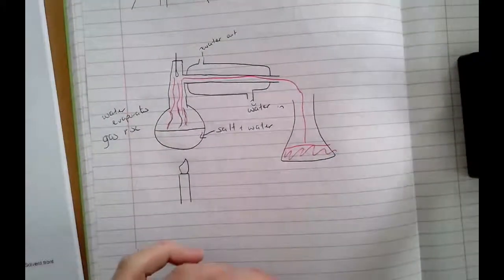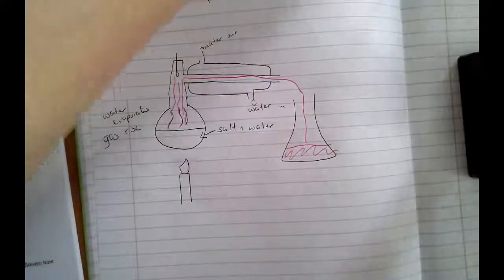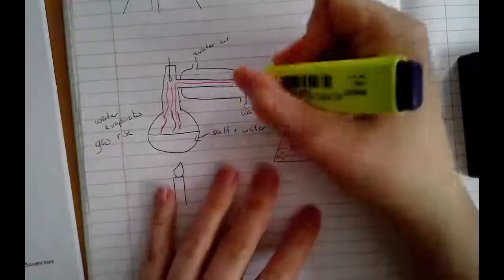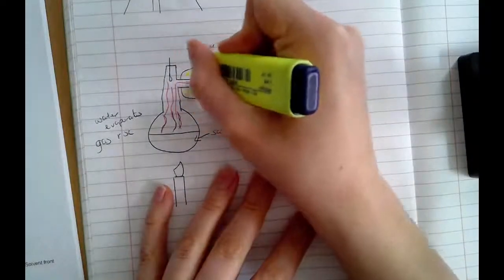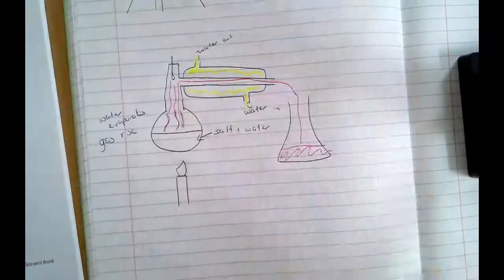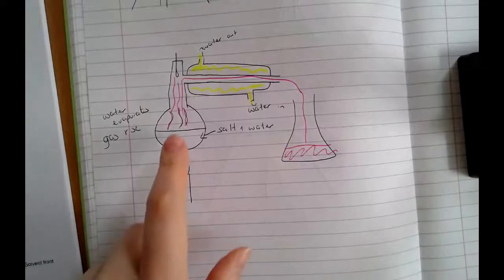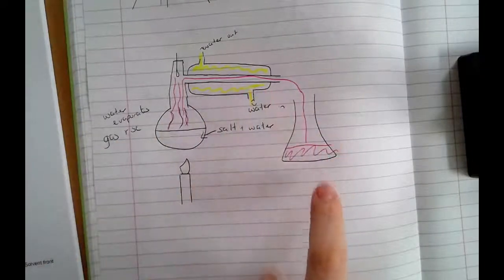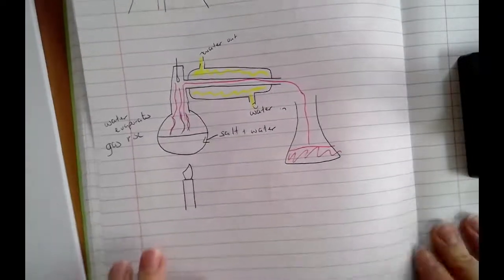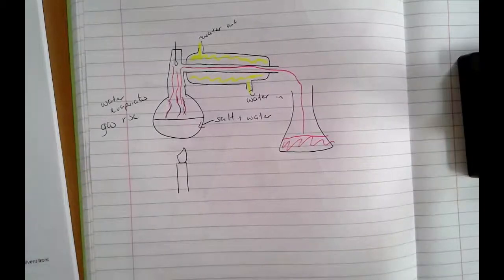The water coming from the tap, which I'm going to draw in a different colour, yellow. The water that comes in from the tap is purely just to keep the condenser cold, but it doesn't mix with the water from your experiment. It just keeps your condenser cold, so you get efficient state change from the gas back to a liquid. A few things to point out on this diagram. You're not going to be asked to draw this diagram, but just a few things to point out, okay?